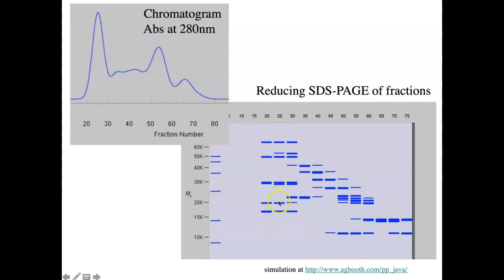pretty much all together. And my question for you is, why might you get really low molecular weight proteins? Why aren't these bands coming somewhere over here in the fraction 60 or so, right? Why are they coming in the excluded volume? Hopefully you paused and thought for a little bit, right?